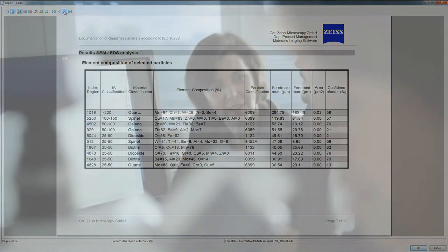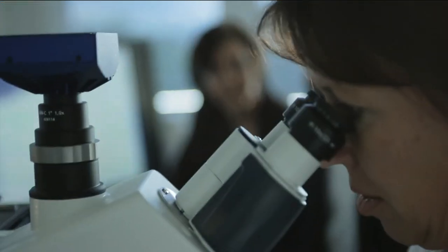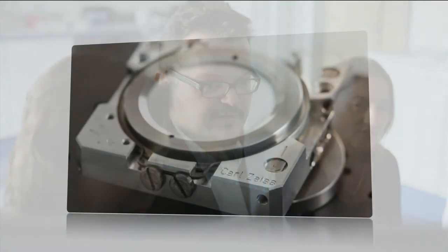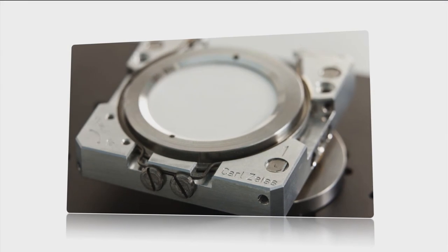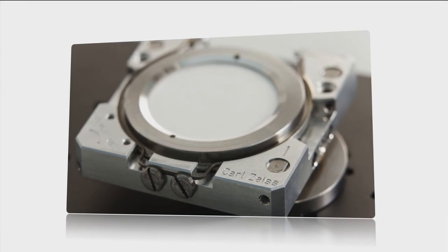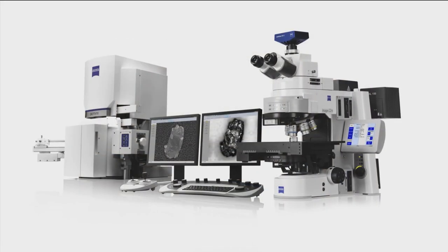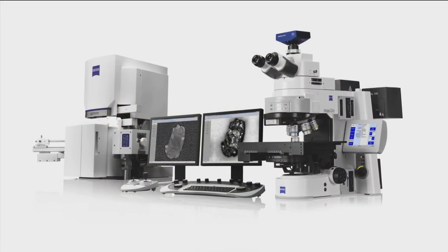You can work up to 10 times faster using correlative particle analysis than when you perform each analysis separately on the optical and electron microscope. Zeiss correlative particle analysis provides you with extra certainty, quickly and efficiently.